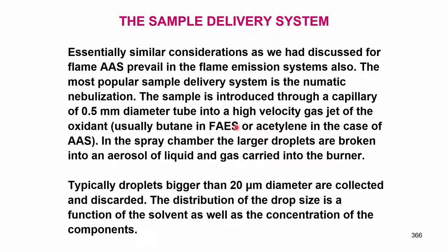If I use a very low boiling solvent with a lot of vapor pressure, the drop size is smaller. If I use water, drop size is bigger. If I use glycerol or something like that, drop size will be still bigger. So, it is better to use water or a mixture of water and alcohols which will give you smaller drop sizes. Smaller the drop size, less is the amount of heat required to convert it into vapor.